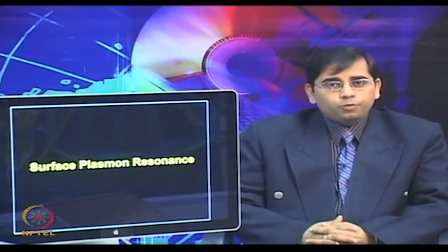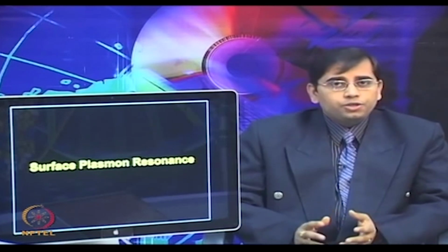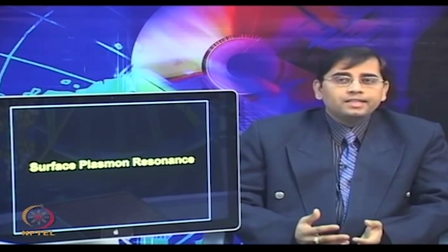SPR is used to probe interactions between an analyte in solution and a receptor that is attached to the SPR sensor surface.